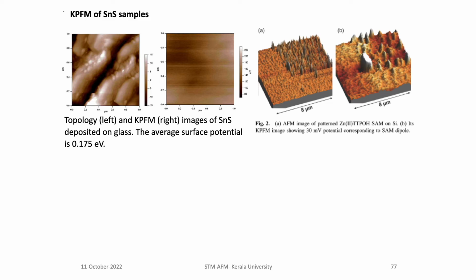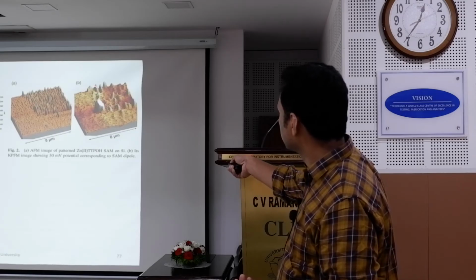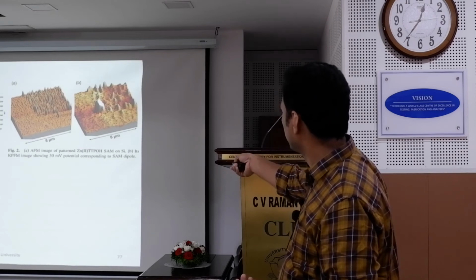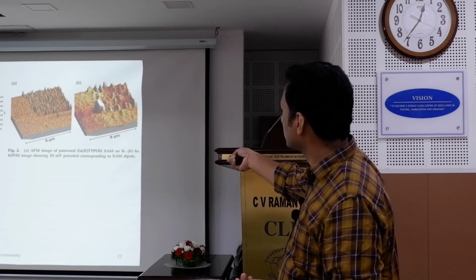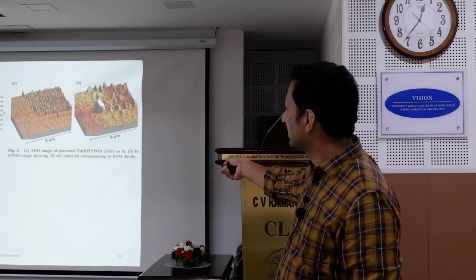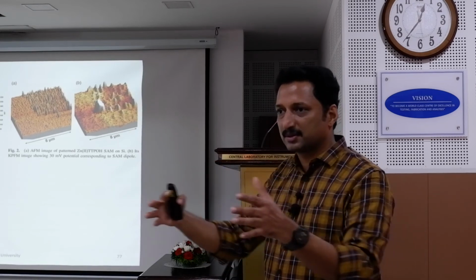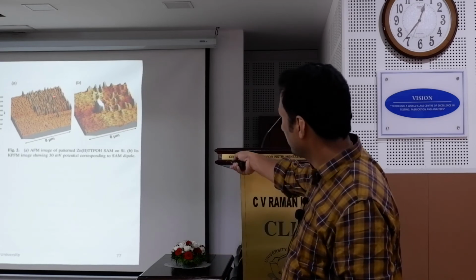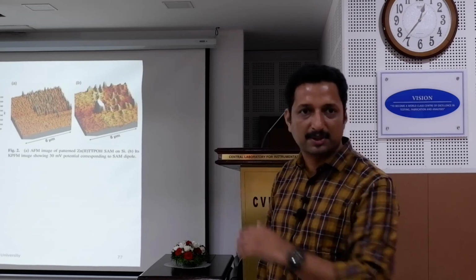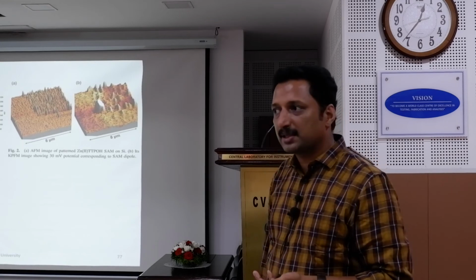this is a complicated material we did in collaboration. There are self-assembled monolayers in this regime. You can again measure, this is the height image, and this is the KPFM. That means the surface potential image. You can see the agglomeration of molecules creates more work function there, which we cannot see here. Okay, so the work function is coming from how molecules are staying closer and how their configuration is together. Okay, so that we can actually measure very clearly. Whatever we don't see here, we can actually see in the same image, but the Kelvin probe image. Okay, and now for measuring the work function of a material, there is something called Kelvin probe.